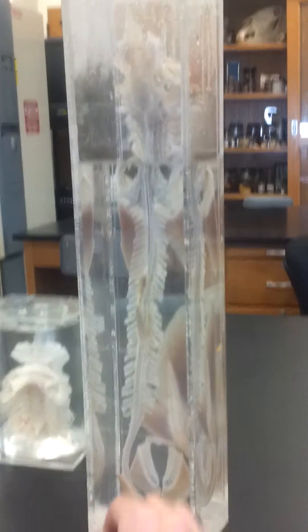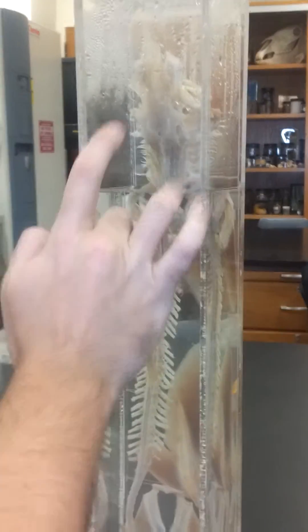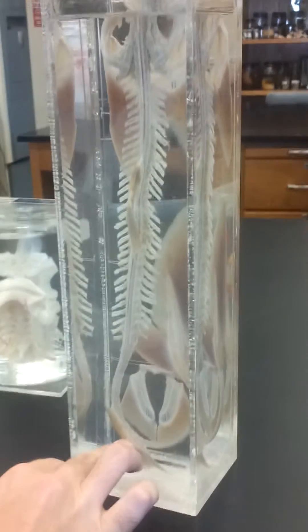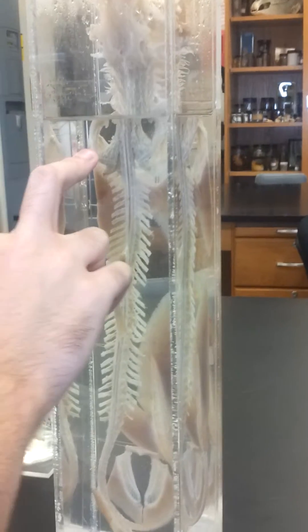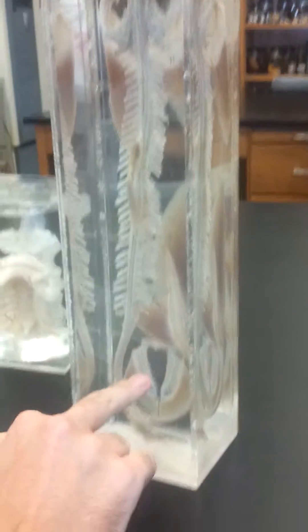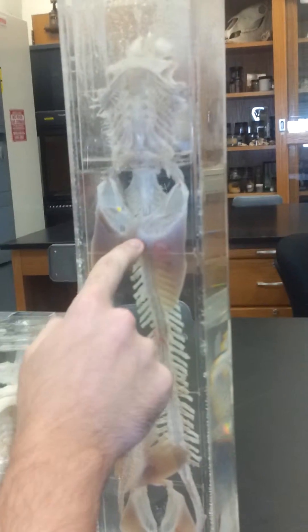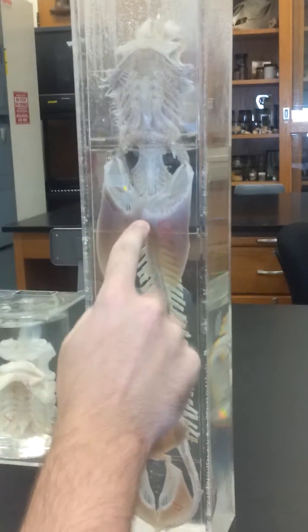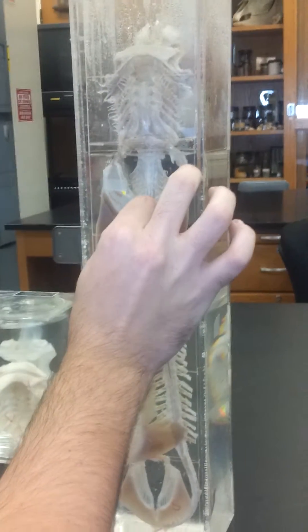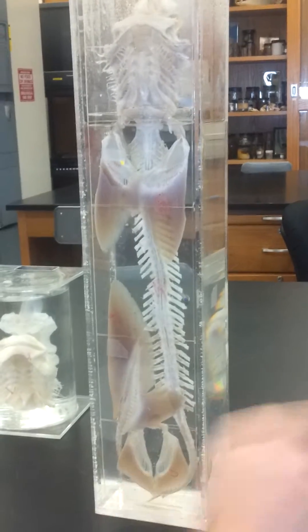We also have the pectoral girdle here and the pelvic girdle here. The difference between the two is that the pectoral girdle bears weight while the pelvic girdle does not. The pectoral girdle has a bone called the scapula coracoid bar, which connects the two fins and allows movement, while the pelvic girdle is not involved in movement and does not bear any weight.